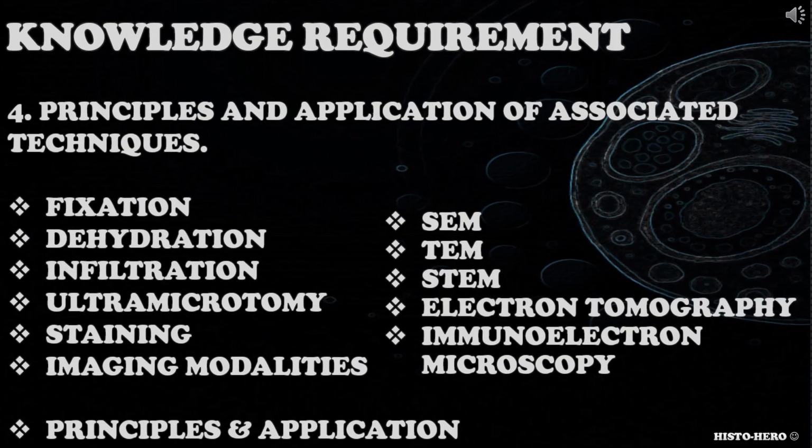The fourth knowledge requirement is principles and application of associated techniques. Candidate needs to have the knowledge and understanding about associated techniques. You could ask the candidate to name the techniques associated with electron microscopy, to explain their principles, to explain their application.